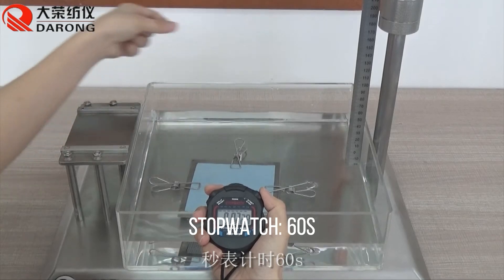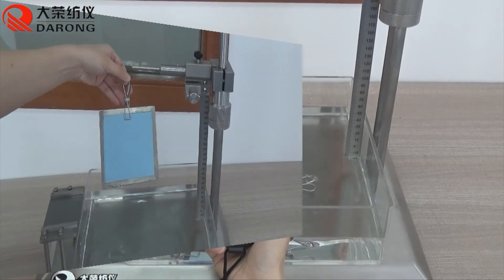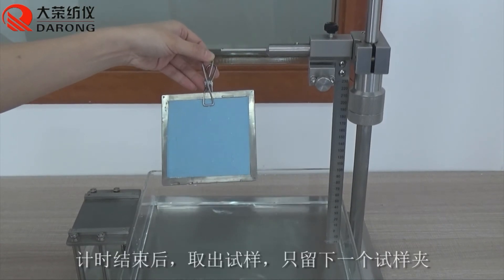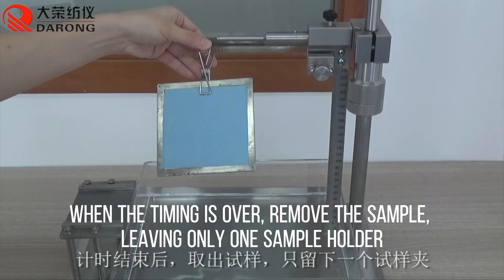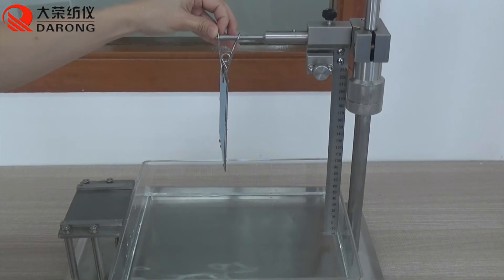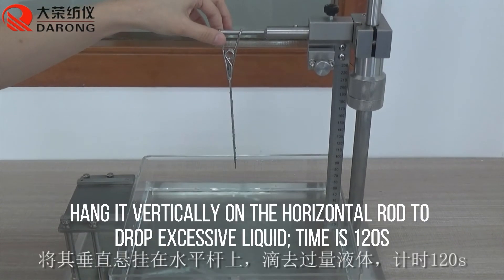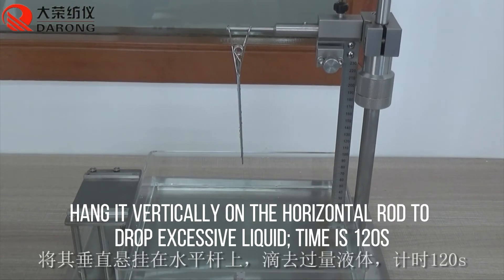Start the stopwatch for 60 seconds. When the timing is over, remove the sample, leaving only the sample holder in place. Hold it vertically to allow excessive liquid to drip off. This draining time is 120 seconds.